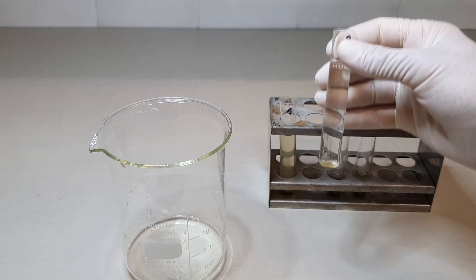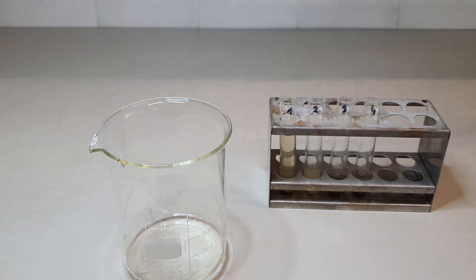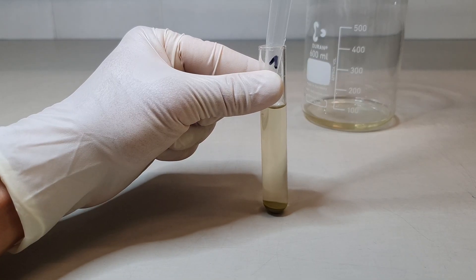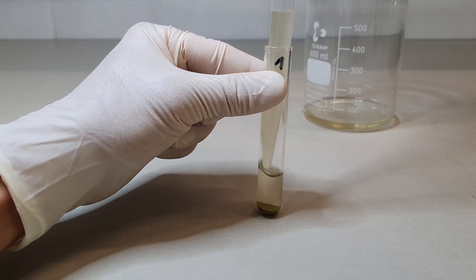After centrifugation, decant the supernatant with a quick movement of your hand so as not to lose any sedimented material. Alternatively, you can also extract the supernatant by using a pipette.